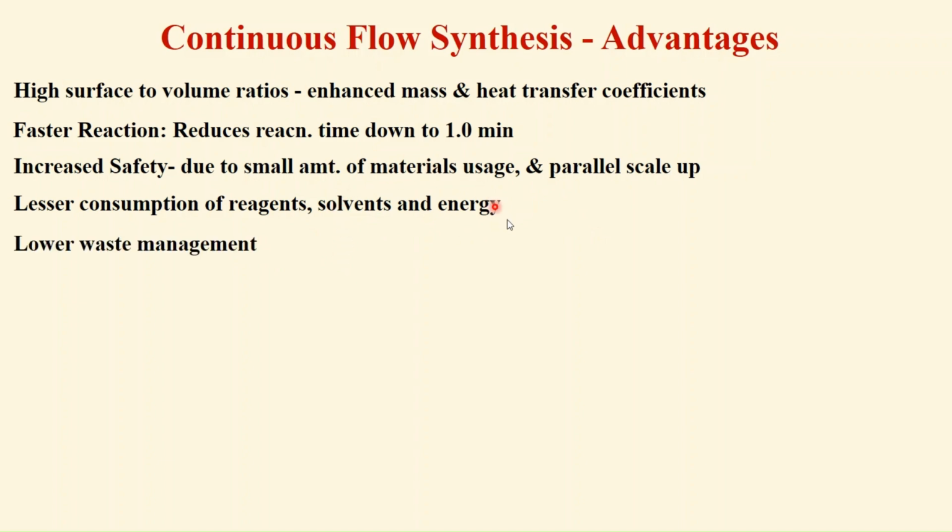As it is used in an efficient manner, low waste is produced, and that's why management of it is also equally easy. The highly exothermic reactions can be controlled very efficiently because of the microreactors. Cooling is more efficient.